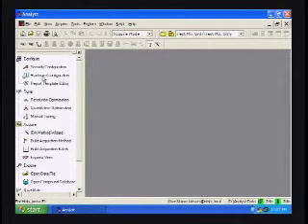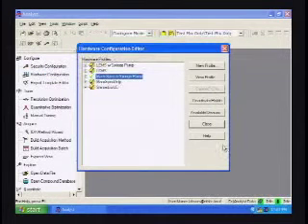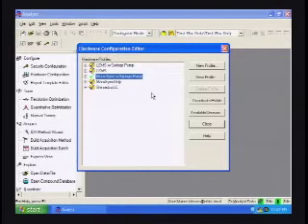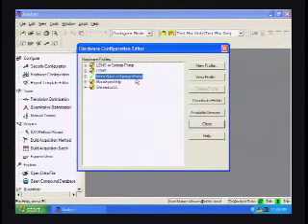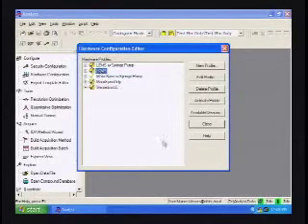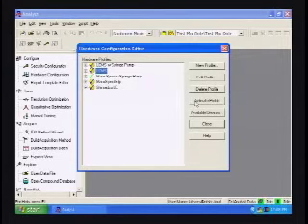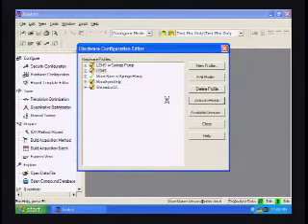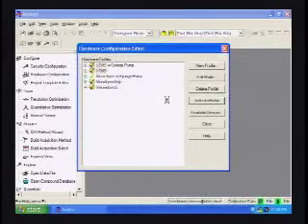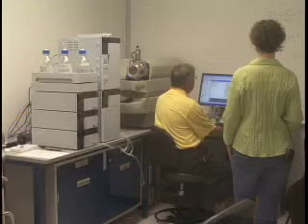So we do not wish to save that. Let's go back to hardware configuration. And we're set up with a syringe pump. The object of this experiment is to test the integrity of the entire system. So we don't want to introduce a sample through the syringe pump. We want to test the integrity of the liquid chromatograph. So let's activate the LC-MS profile.